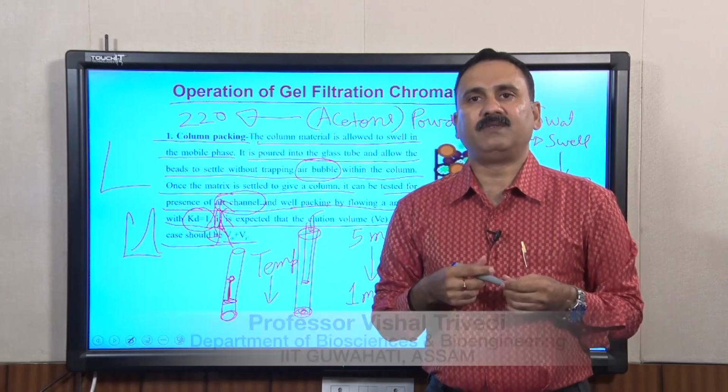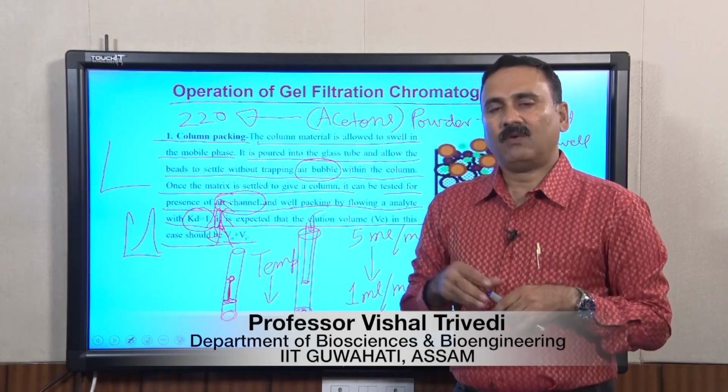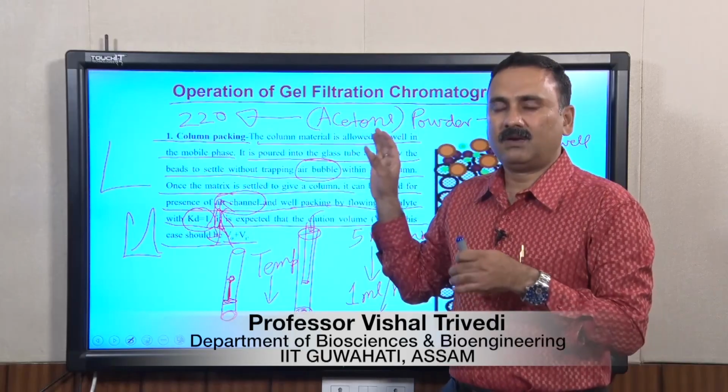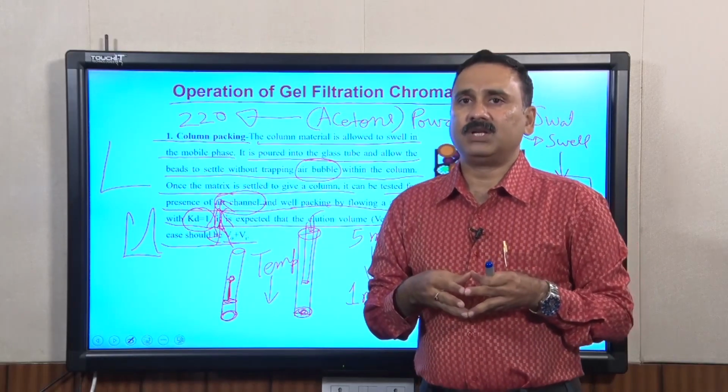Hello everybody, this is Dr. Vishal Trivedi from the Department of Biosciences and Bioengineering, IIT Guwahati. So far we have discussed different processes, what you should follow and what we should not follow while doing the gel filtration chromatography.